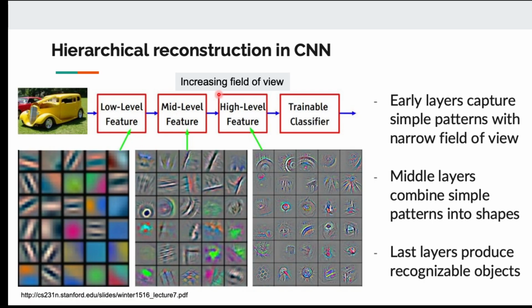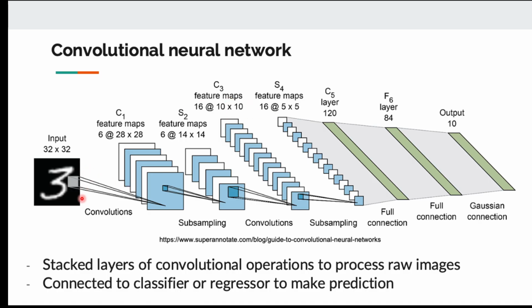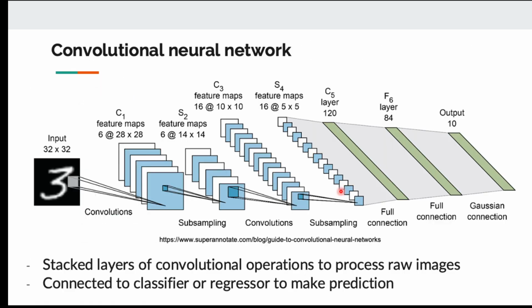They're going to identify simple changes in the image. But the idea of convolutional neural networks, if we go back to this diagram, is we are not doing the convolution operation one time. In this example, we only do it one time. But the idea is we are going to do convolution on top of convolution. So let's say we create a sharpened image. We're going to do convolution on the sharpened image to create the next image. So we're going to do convolution in sequence, multiple times. And in modern models, they might have 100 layers of these. So they're doing convolution hundreds of times.